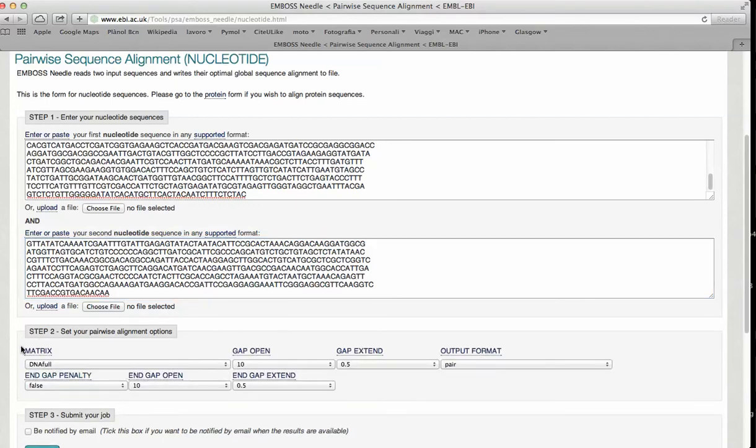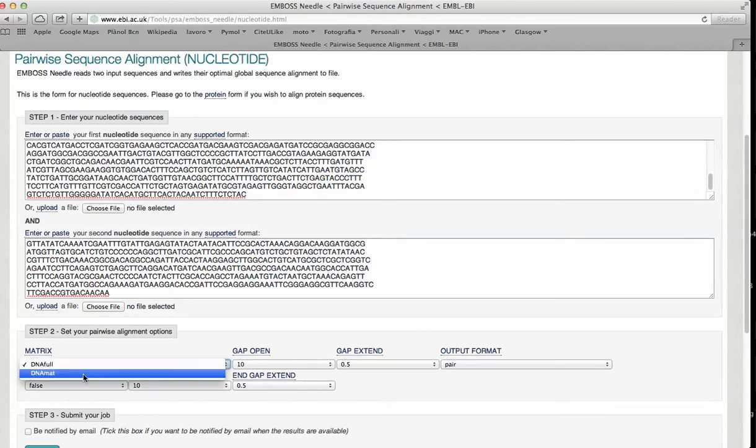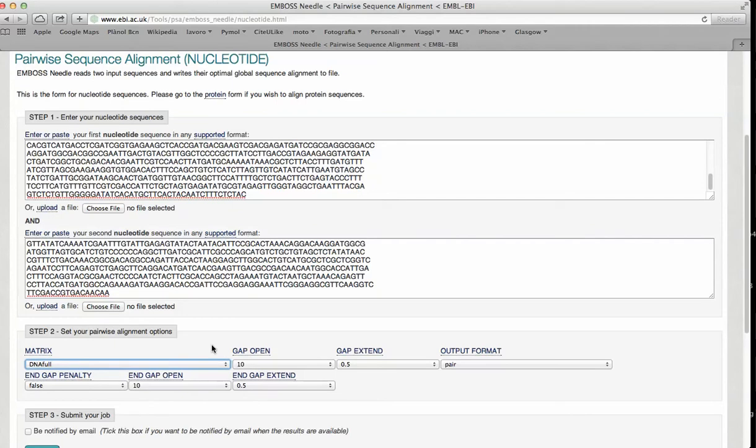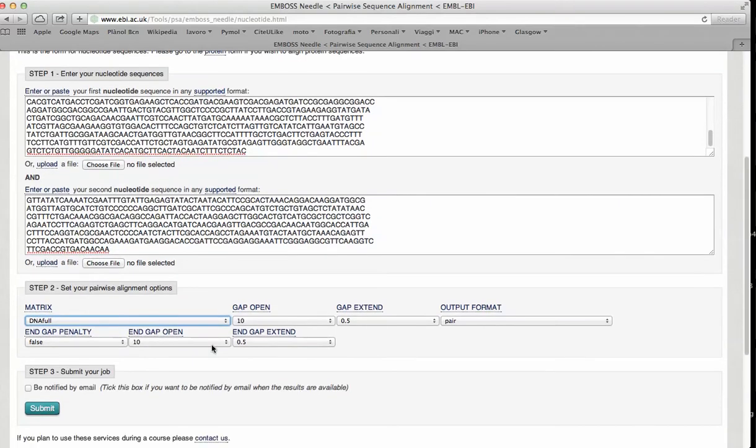In this case, the matrix, the program detects that this is a nucleotide sequence and the matrix is changed according to the matrix for the comparison between nucleotides. We are going to submit this job.